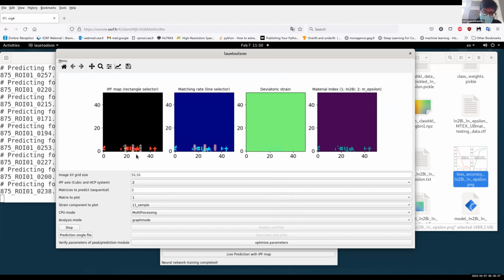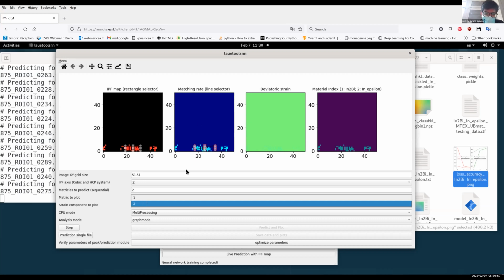So you can do several different analyses. The indexation approach is very simple. It uses a simple neural network-based algorithm. Apart from that, you can do several other post-processing steps online while the indexation is happening to really fine-tune your next experiments or the one that you're already doing. So that's the whole objective of developing such techniques.